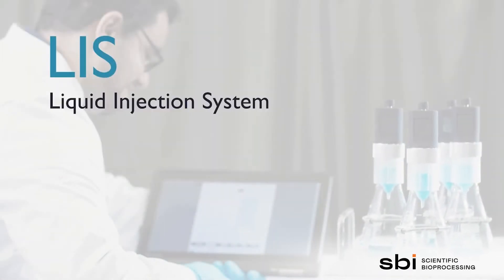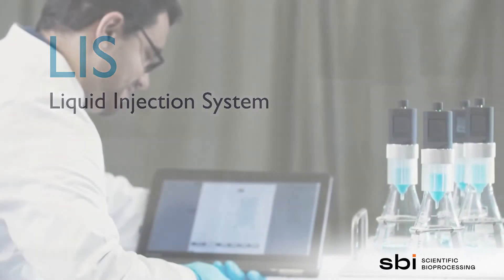The liquid injection system, LIS, is the first technology allowing for automated feeding of liquids into shake flask cultures.